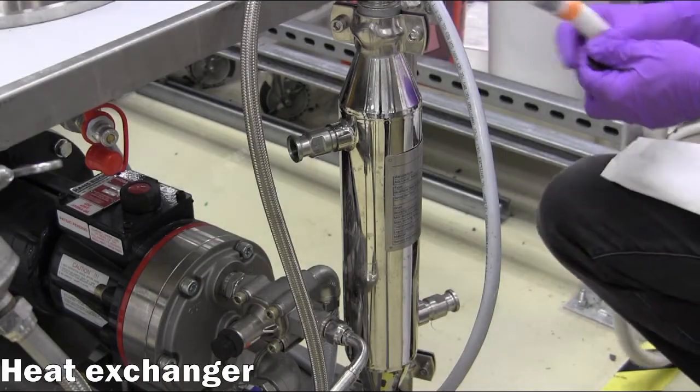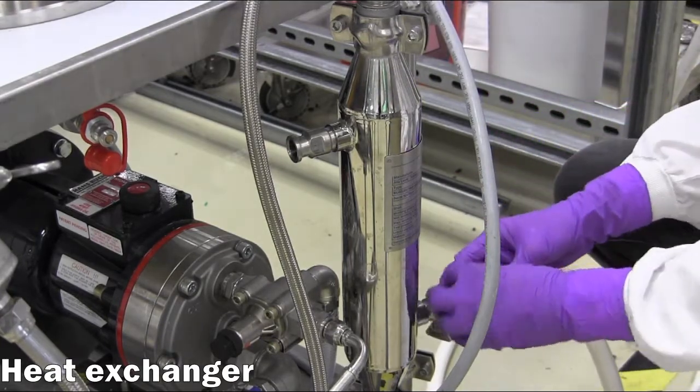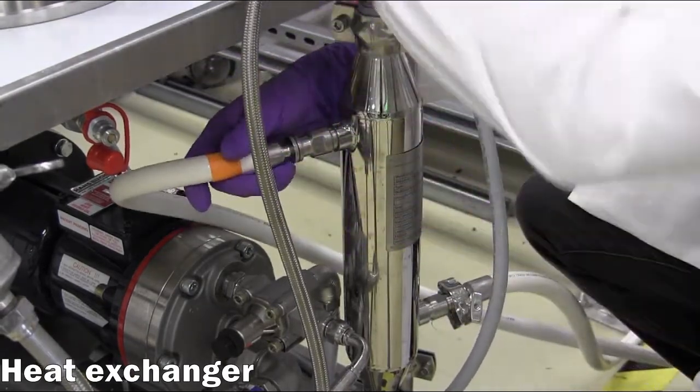Lastly, make the hose connections to provide chilled water to the heat exchanger, where the supply line is connected to the bottom side port, and the return line is connected to the top side port.